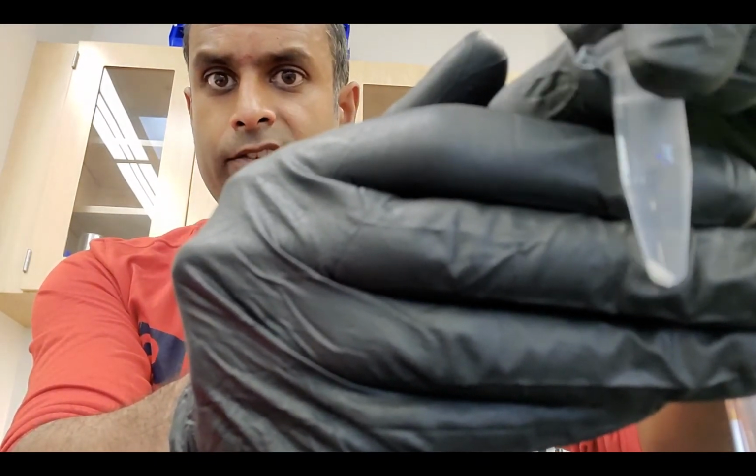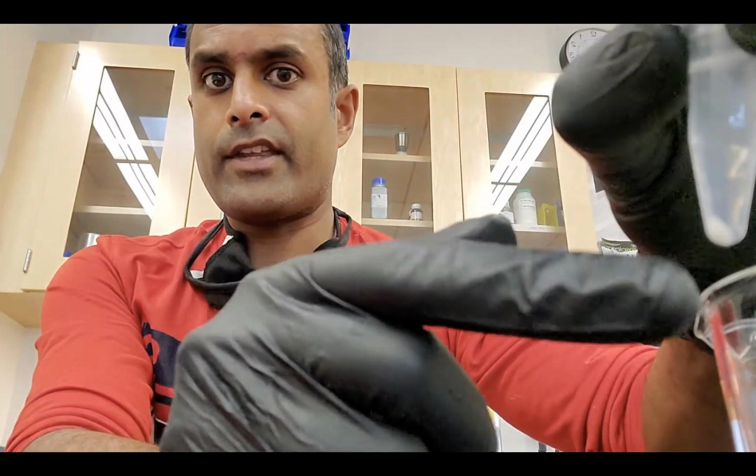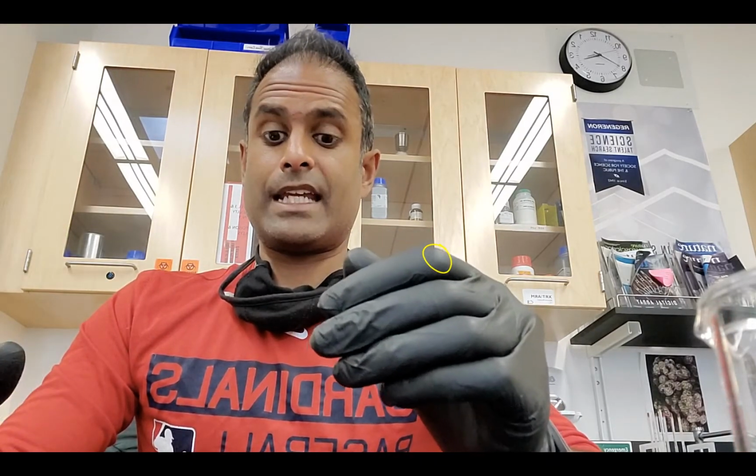All right, now if you notice there, I have liquid in the tube up to about here, and then I have a little white thing down there. And if we're playing the game, where is my DNA? Then my DNA is in the cells in the white stuff now.